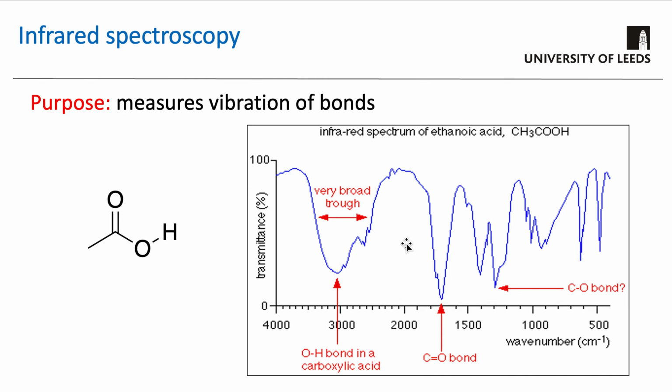So what you're going to do in this experiment is run an infrared spectrum of your unknown sample. You're going to look at where the peaks are in the IR spectrum, and then work out what bonds you've got. Based on what bonds you've got, and matching it up with the information from the TLC, that will help you work out the structure of your molecule and which of those three compounds your unknown sample is.